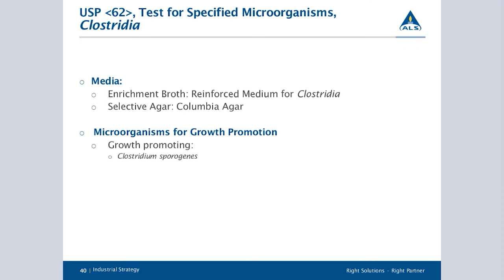Now for Clostridium, generally this organism is tested for aerosol type products due to its packaging, or it should be included for products or raw materials from animal origins due to the risk of fecal contamination, especially with raw materials that come from nature.